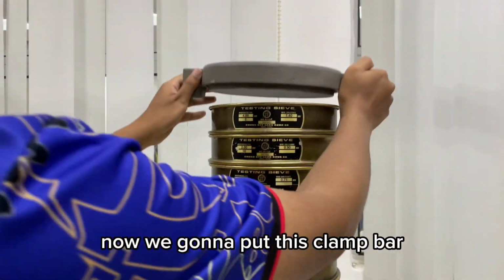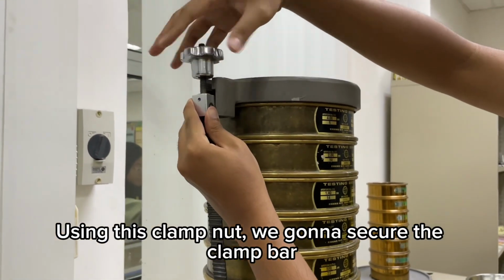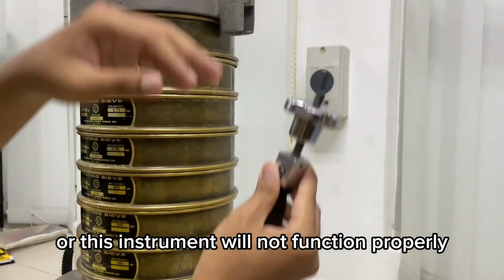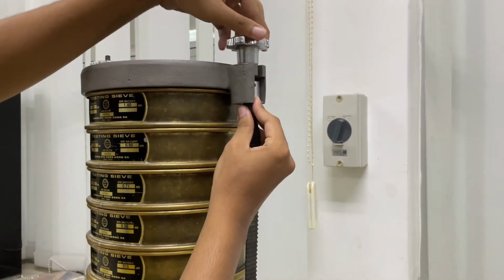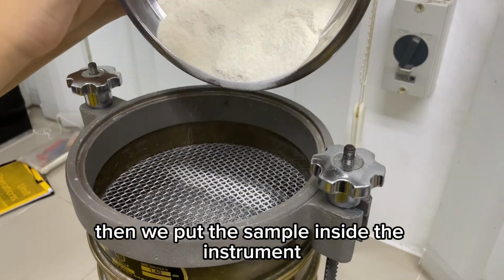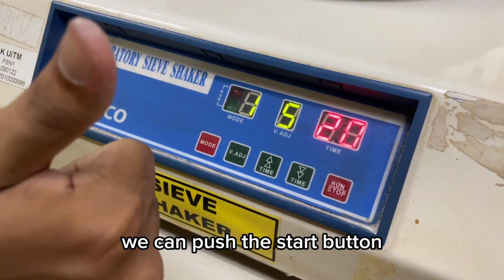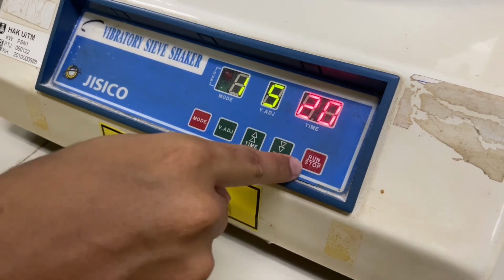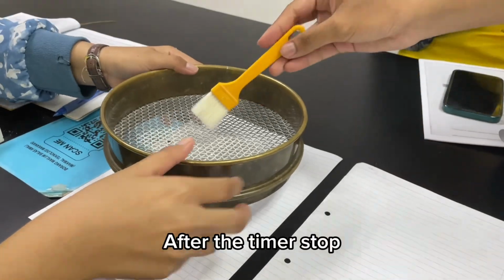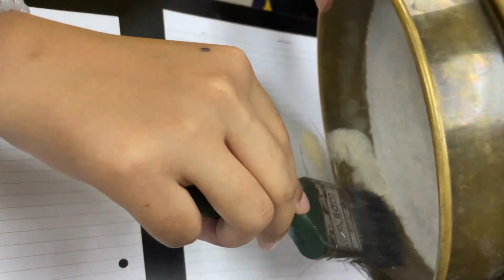Now, we're going to put this clamp bar at the top. Using these clamp nuts, we're going to secure this clamp bar to make it tighter. But remember, don't make it too tight or this instrument will not function properly. Now we can set the timer according to the lab manual. Then we put the sample inside the instrument. After making sure everything is correct, we can push the start button. After the timer stops, scrape all of the sample from each basket like this.